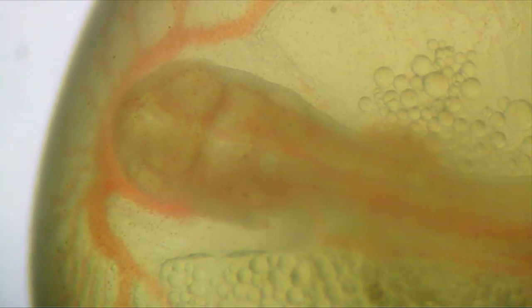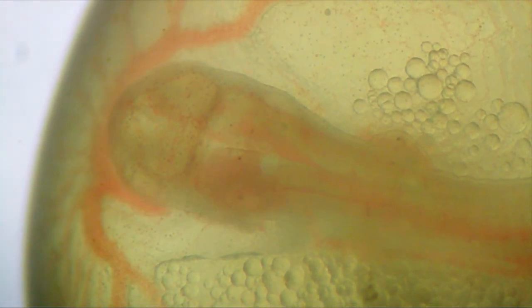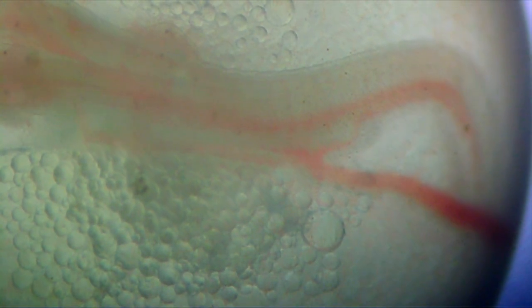You can also see the oil droplets and the developing notochord for the backbone, which turns into the fish's musculature. You can even see the little sections where the muscles will become the tail, and this blood from this tiny heart is flowing completely around the egg and bringing oxygen to the entire egg.